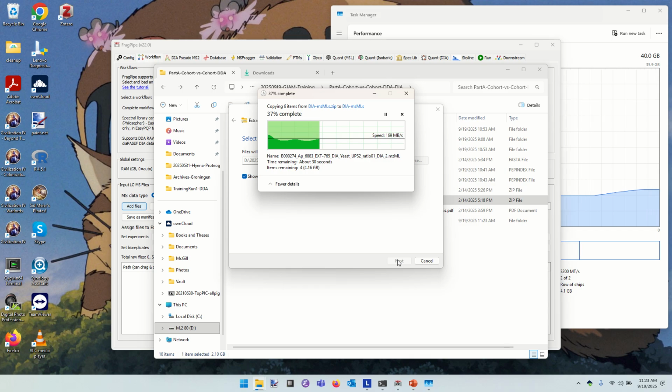Oh, did the laptop melt down? Hopefully. If these spectra are larger, they require more RAM to run the analysis. He already ran out on the DDA. You have no chance now. No, exactly. So sorry. Okay. Yeah, there's always the risk that the laptops will not measure up to the moment. The worst part is when my laptop does that. So, yeah.